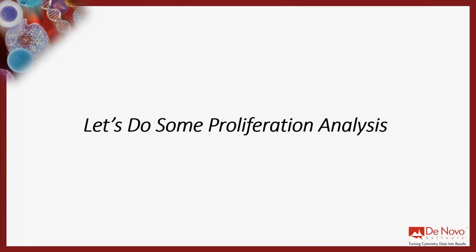I'm going to do that, but I just want you to know that we do have resources for that on our website that go through getting started with FCS Express and how to do all these things. I'm strictly just going to stick with proliferation analysis.